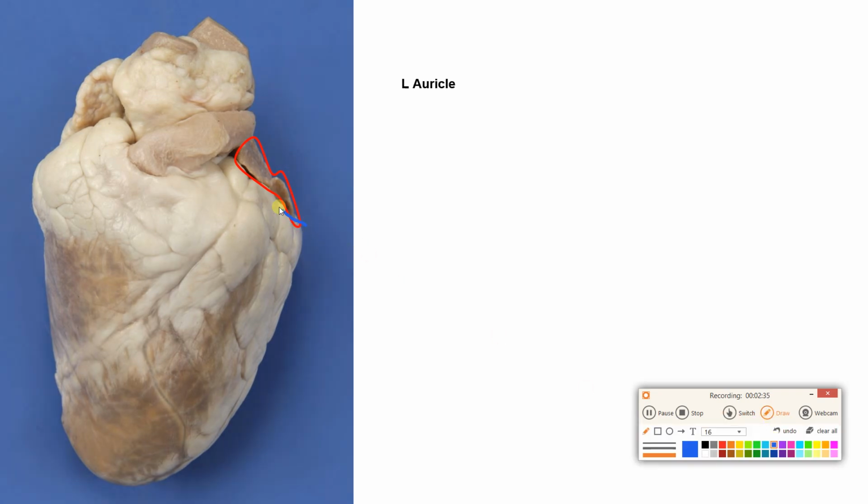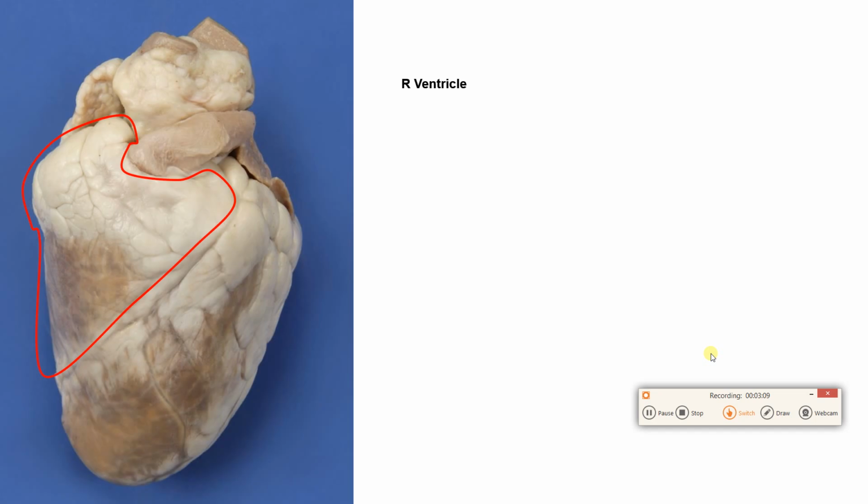And if I actually draw a line right here, this line is going to separate my ventricles. These are my ventricles down below, and my atria are up here. In the sheep heart, the atria are really flat and deflated. The auricles are flat and deflated. Because remember, those are receiving chambers. Their walls are thin. When there's no blood in them, they're going to collapse. All right, so we got our auricles, we got our apex. We're doing some good A words here.